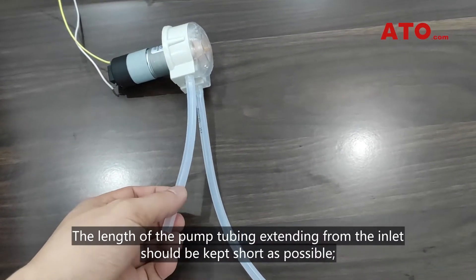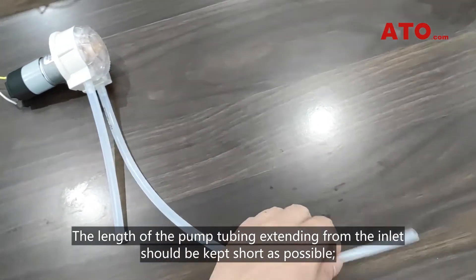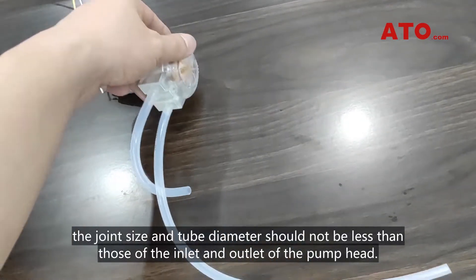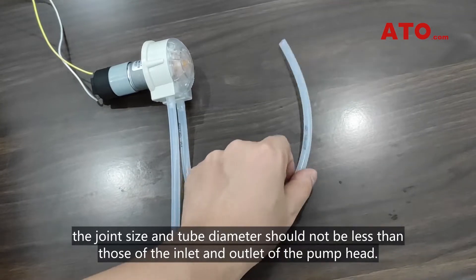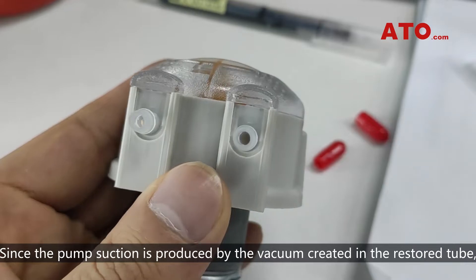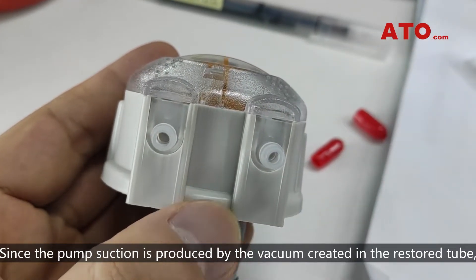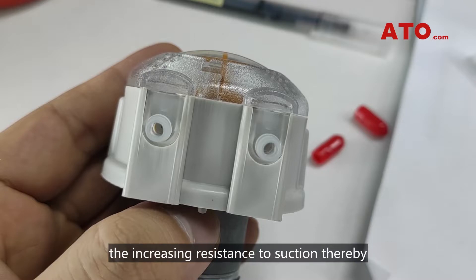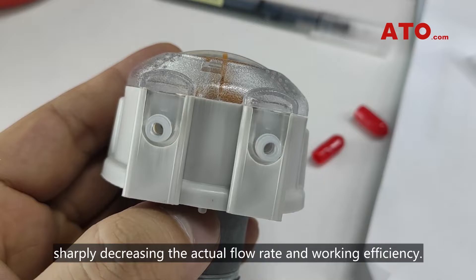The length of the pump tubing extending from the inlet should be kept as short as possible. The joint size and tube diameter should not be less than those of the inlet and outlet of the pump head. Since the pump suction is produced by the vacuum created in the restored tube, if the tube at the inlet has too long a passageway or too small a diameter, the increasing resistance to suction will impede the restoration of the tube, sharply decreasing the actual flow rate and working efficiency.